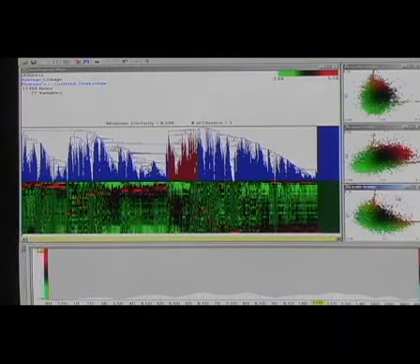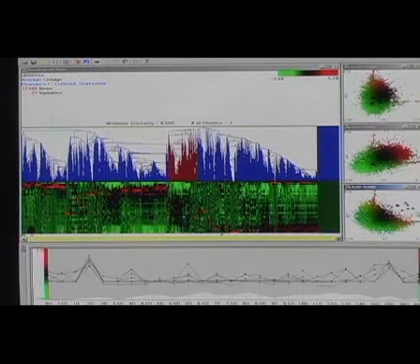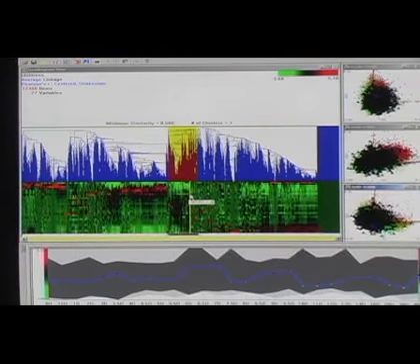The Human-Computer Interaction Lab at the University of Maryland has been developing an interactive visualization tool for hierarchical clustering results. This year, we released a new version of Hierarchical Clustering Explorer, HCE 2.0. This brief demonstration shows you how HCE can help you find interesting patterns in your dataset.